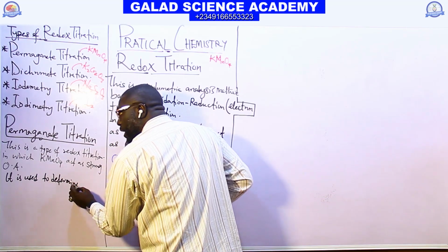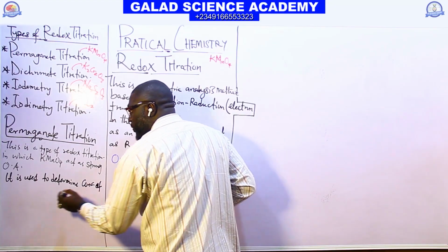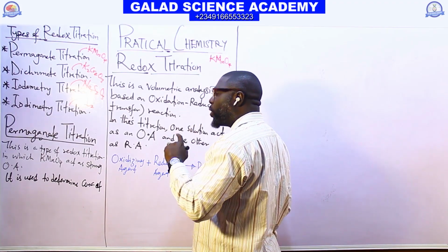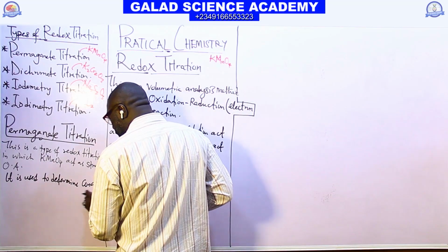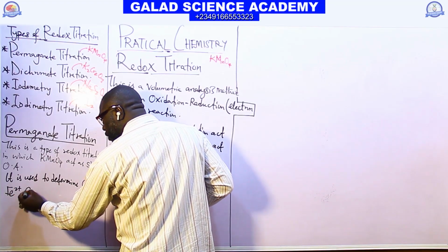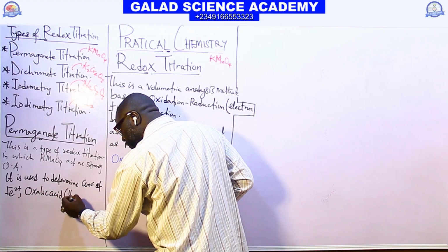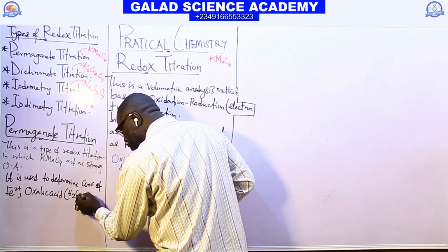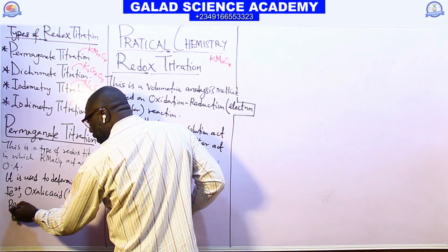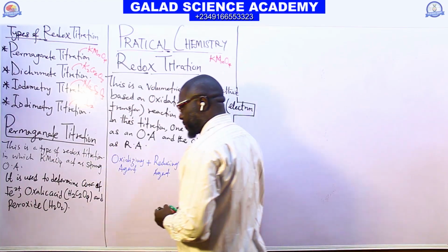It is used to determine the concentration of oxalic acid, H2C2O4, and peroxide, which is hydrogen peroxide.